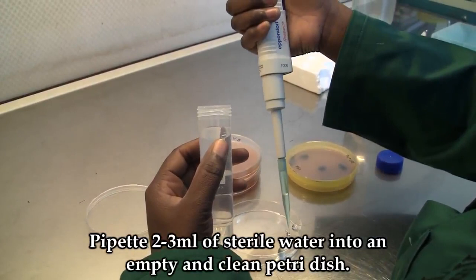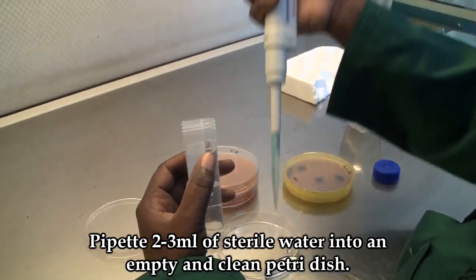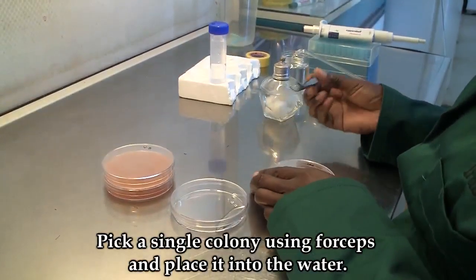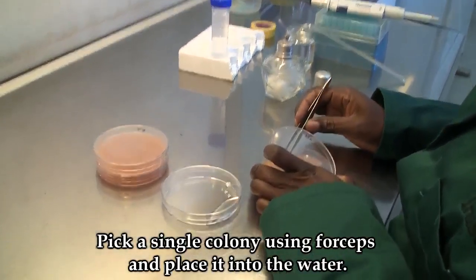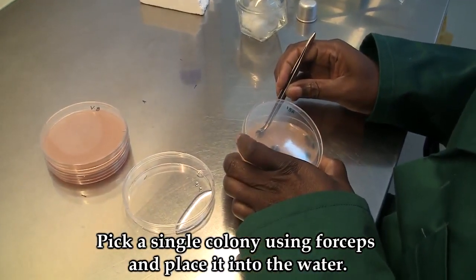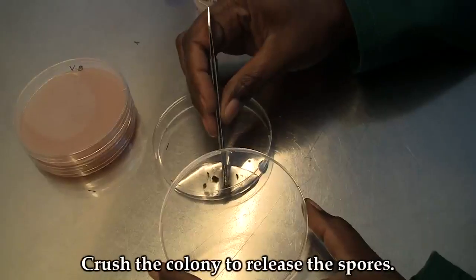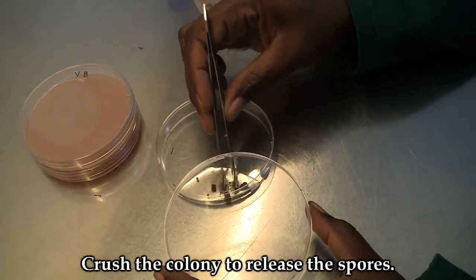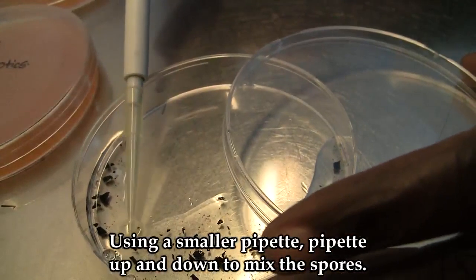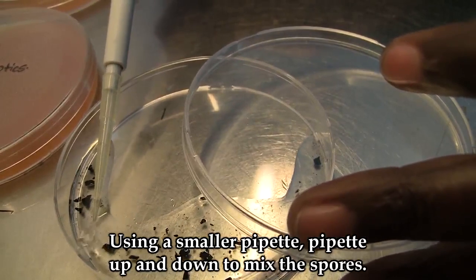Prepare two to three millilitres of sterile water into an empty and clean petri dish. Pick a single colony using forceps, place it in the water, and crush the colony to release the spores. Using a smaller pipette, pipette up and down to mix the spores.